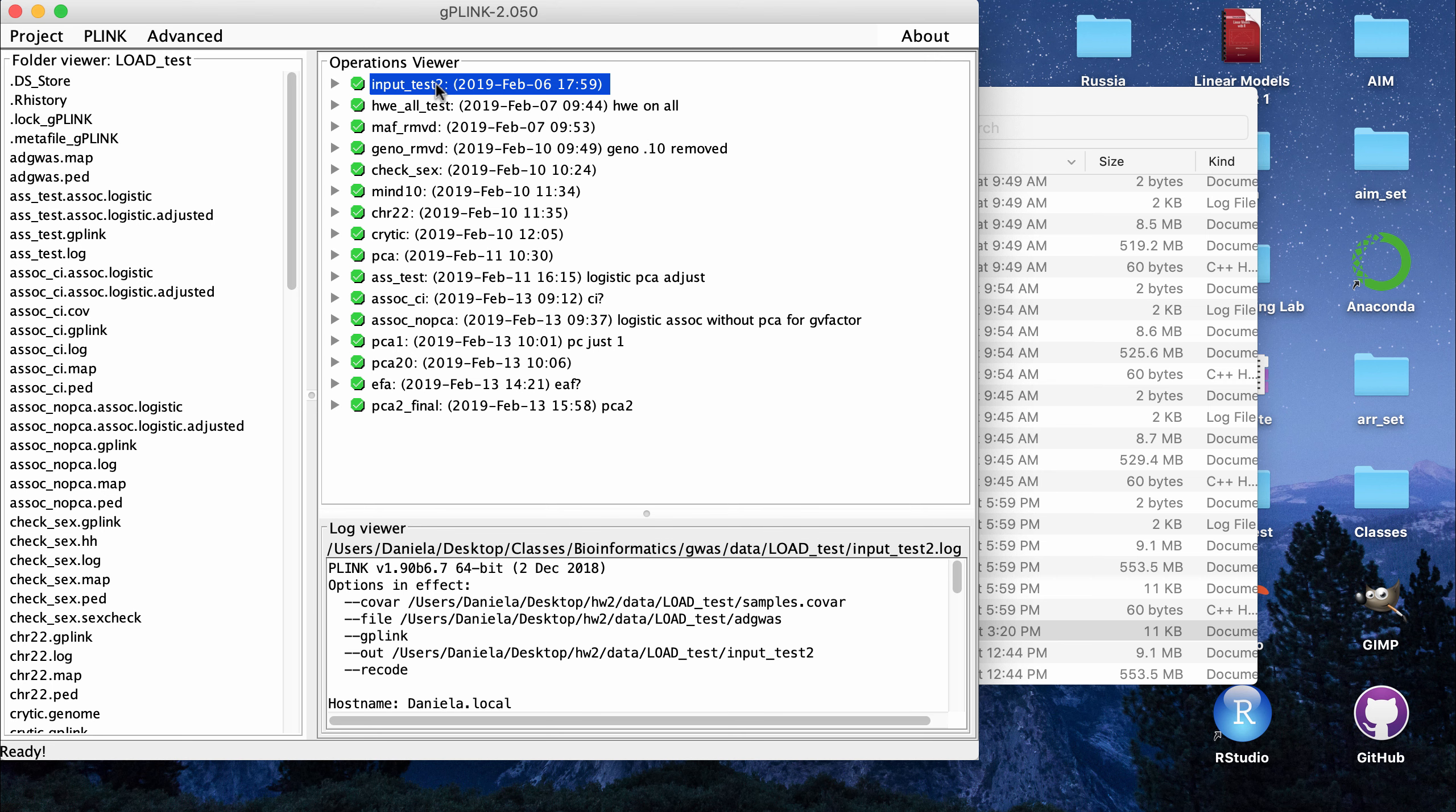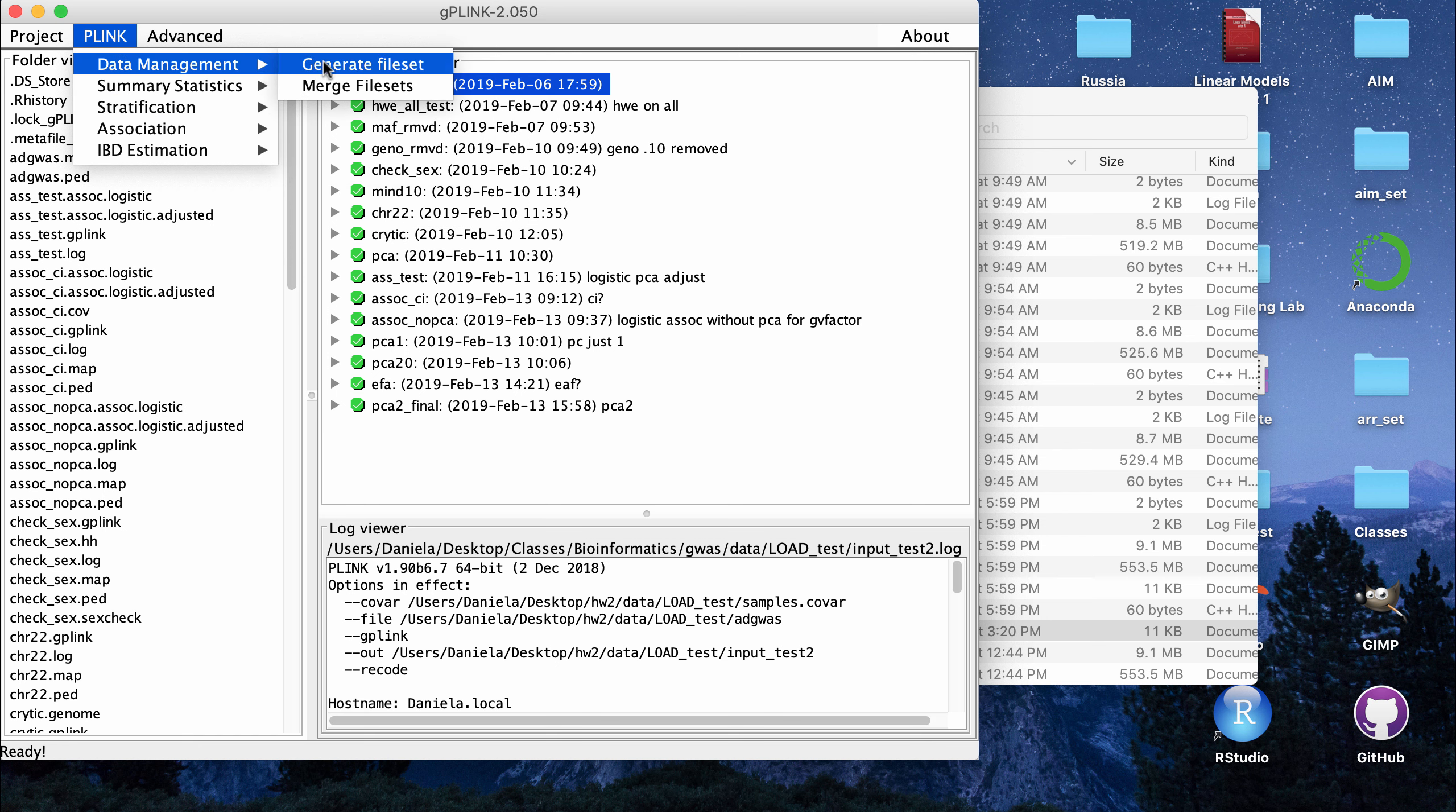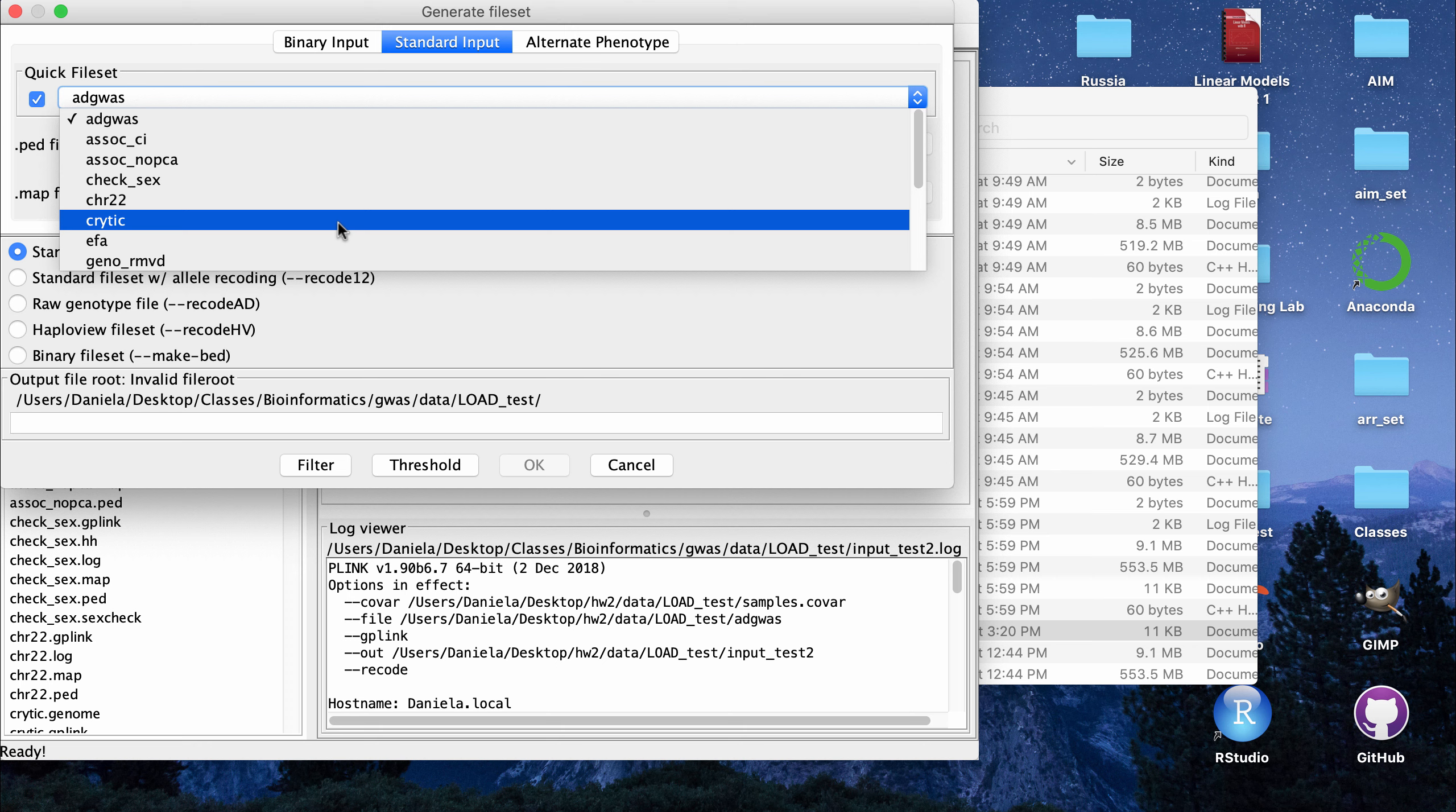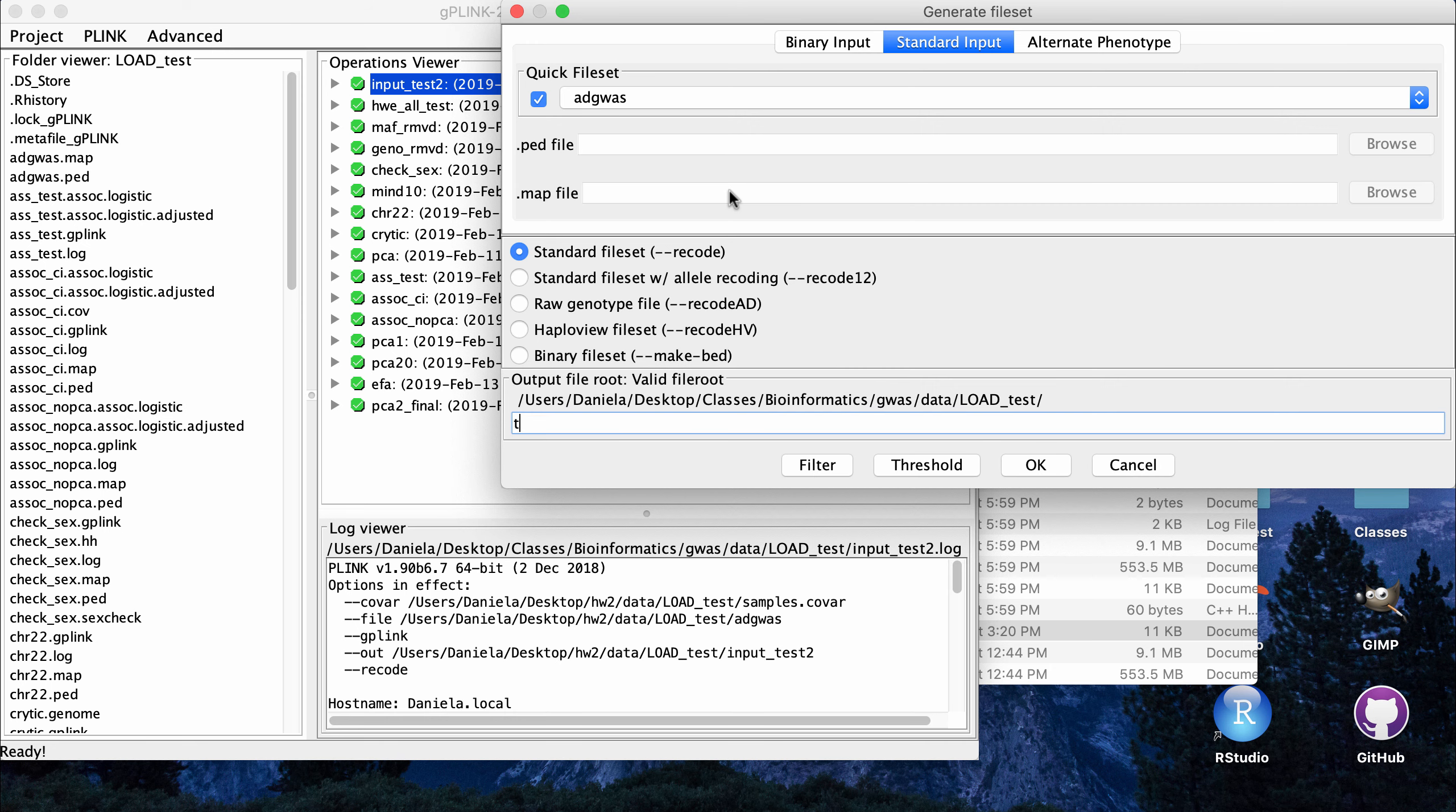So the way I did it was, for example, I started with the ADGWAS or Alzheimer's disease GWAS .ped and .map files, reading those in. And also the sample covariance file. If you want to use the GUI, you have the options to use the flags by picking them using the GUI. Or what I did was I just would go to data management, generate file set. Then I would go to standard input and I would pick the file input that I want to use in my analysis. So the first one that I wanted to use was ADGWAS. And then this area here is the name of what you want to output as. So for every step I named it something else and I tried to give it a name that made sense to what flag I was running or what command I was trying to run.